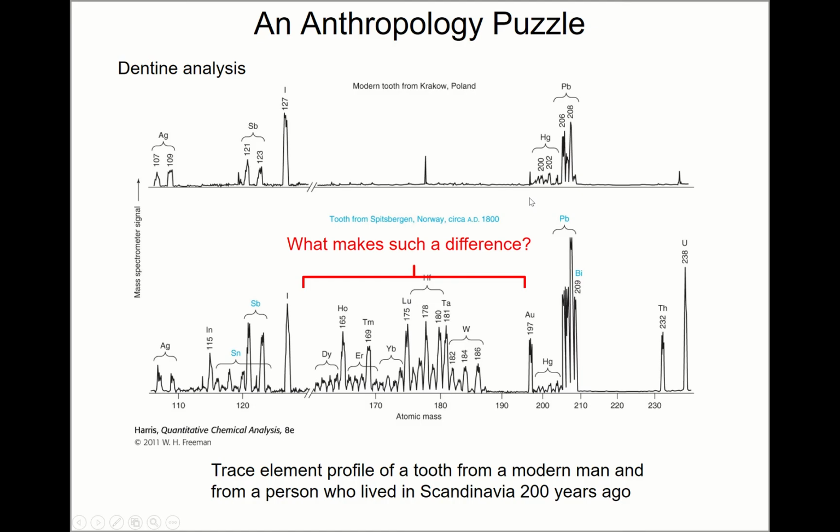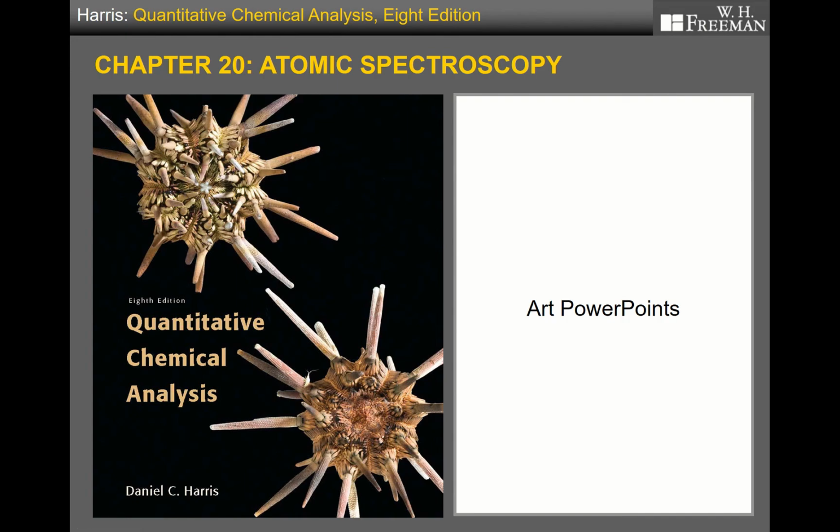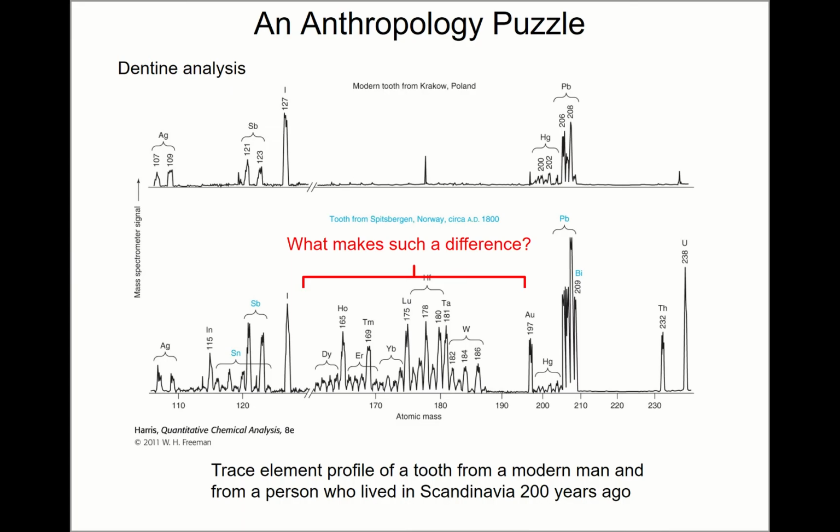Basically, atomic spectroscopy is a destructive technique. Destruction means that the original sample is totally destroyed. You will see soon.